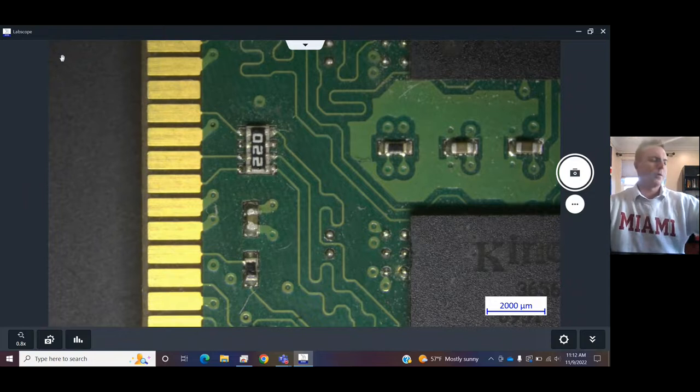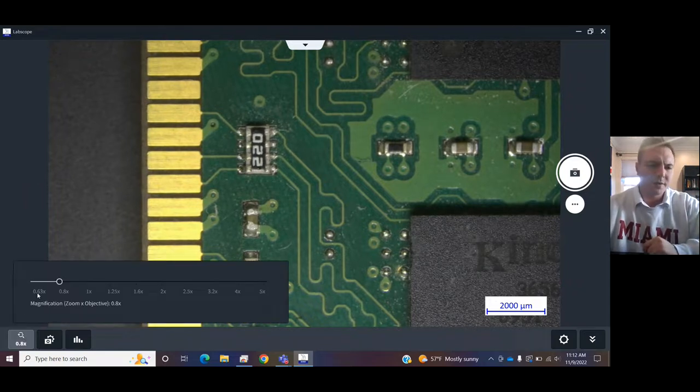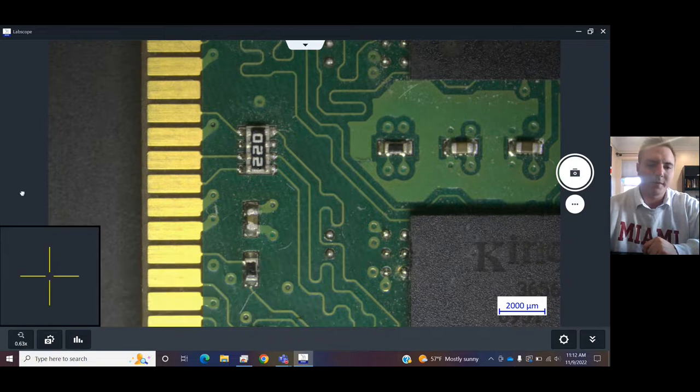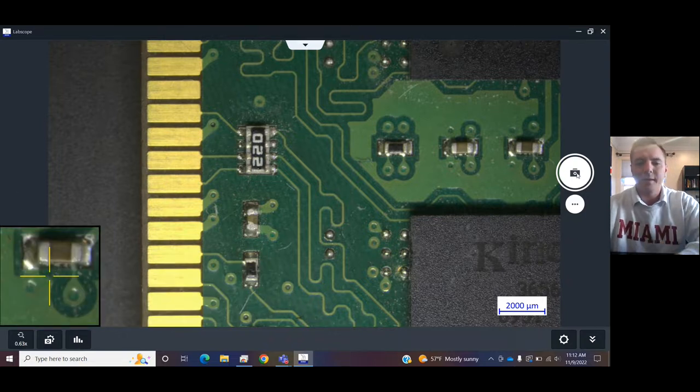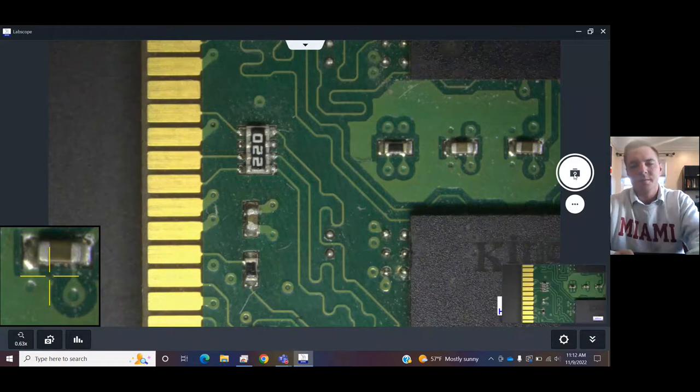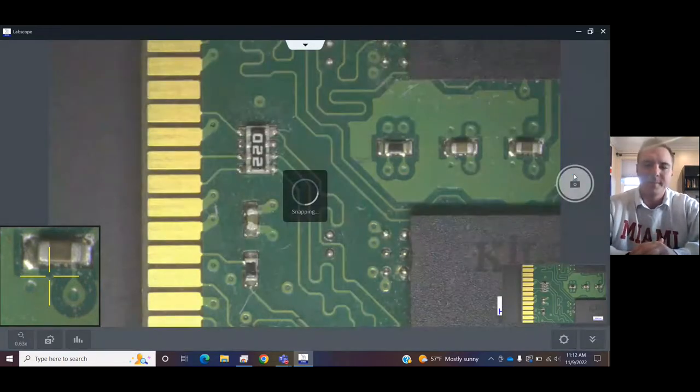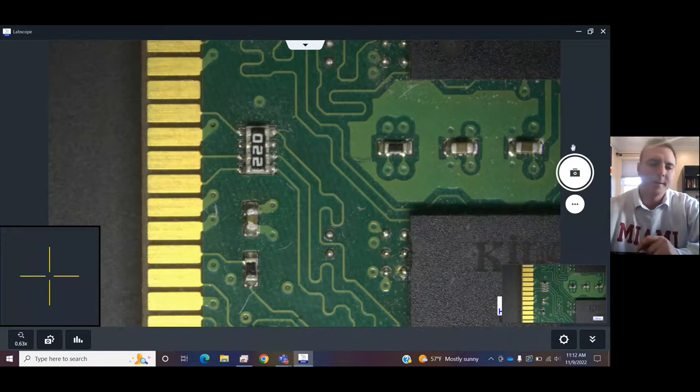So, what you want to do is choose the right magnification in here. Right now, I'm set at 0.63. And then you can snap a picture right there on the right-hand side of the screen. Or you can press the space bar. That's a hot key for it.